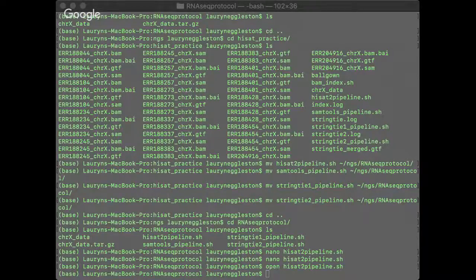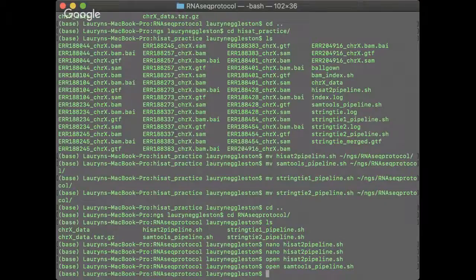I also want to make sure that not only do I change the directory for the reads, but I also change the directory for the index so it knows where to find it. Okay. I also can probably go ahead and make sure that all of my scripts are okay in samples. These will be fine.